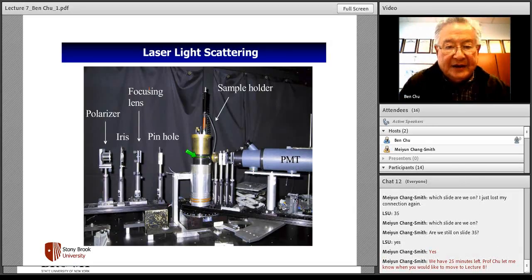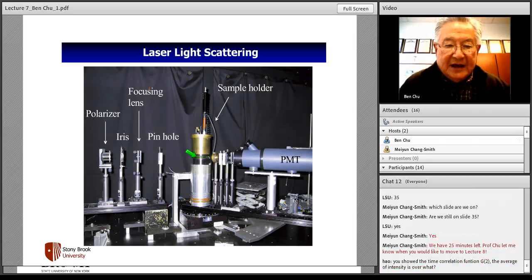You remember that last time we discussed that laser dynamic light scattering can also measure the velocity of particles that are moving around. You don't want that here, so you have to take some precautions. If you intentionally want to do that, you can, but then the geometry will be changed. And then you have detectors and so forth, and a photomultiplier tube. This is the example that I show you. So what do you get out of it from the things that we described?